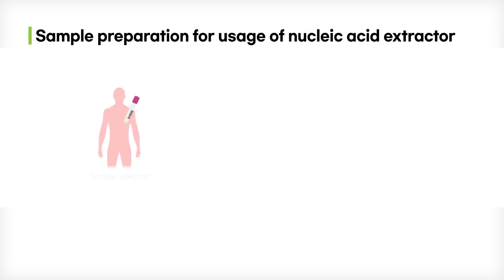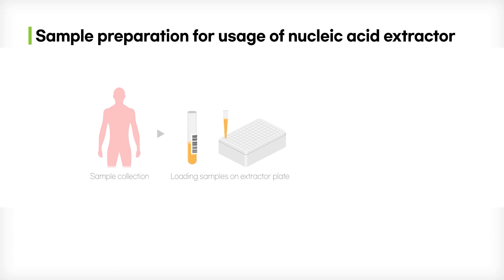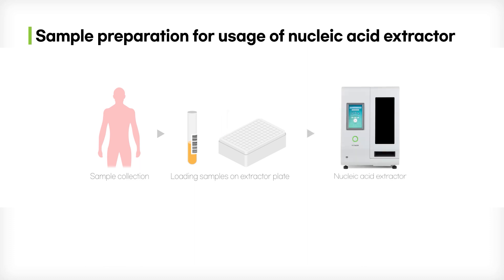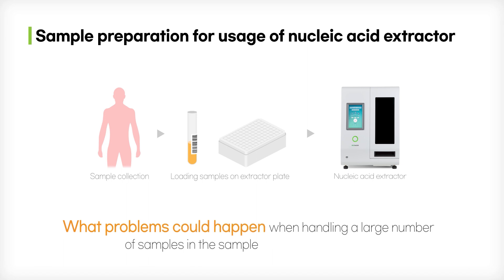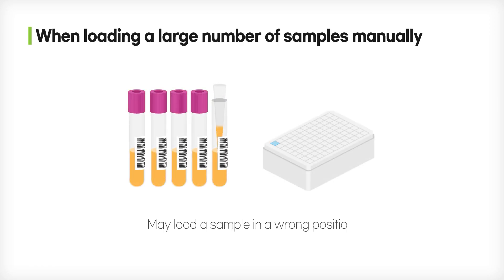Sample preparation for nucleic acid extraction is the process that collects samples and loads them onto the extractor plates. During the process of handling large samples, what problems could occur — first, during the loading of a large number of samples manually, human error could occur, such as samples not being loaded into the correct location.